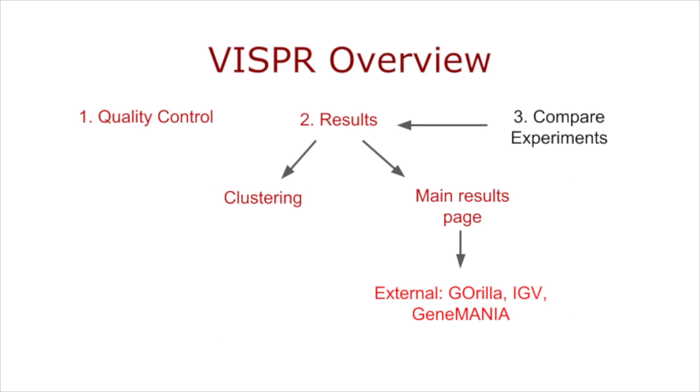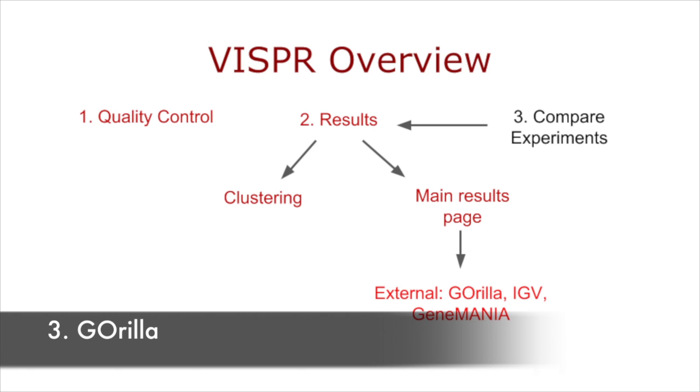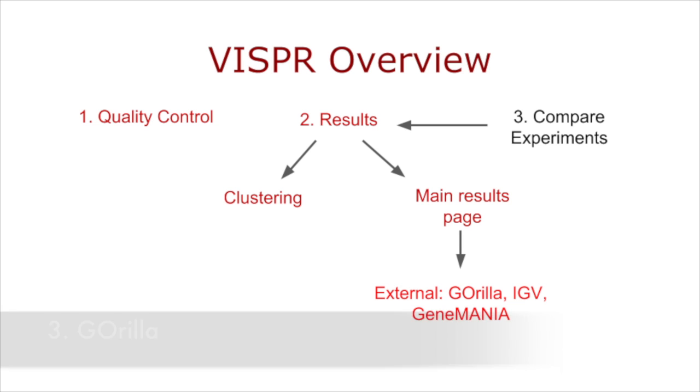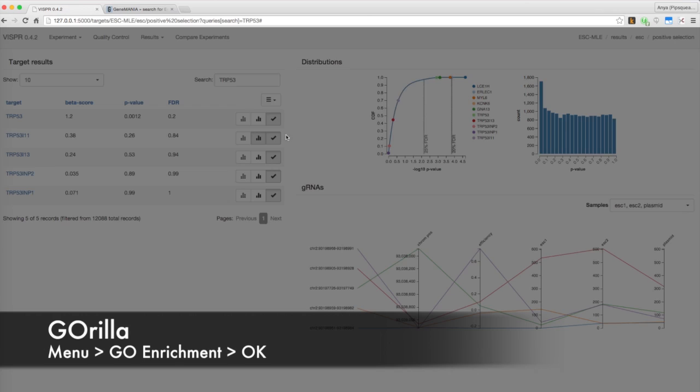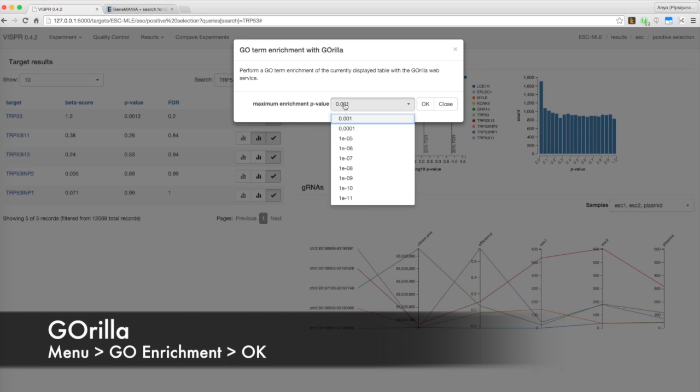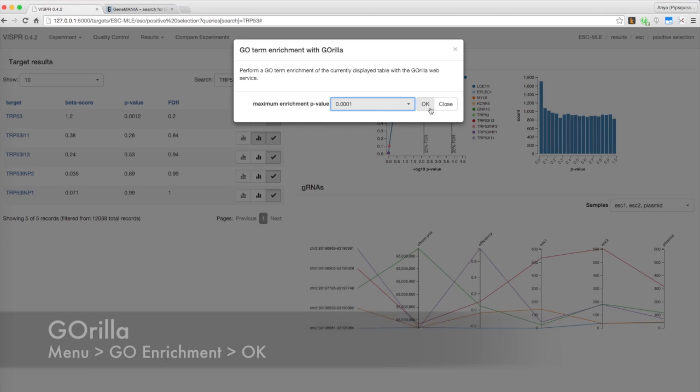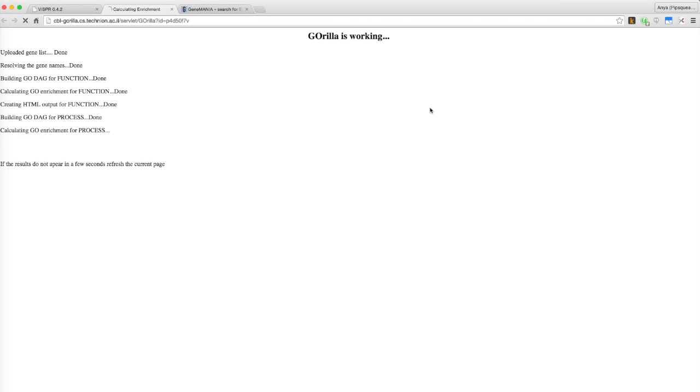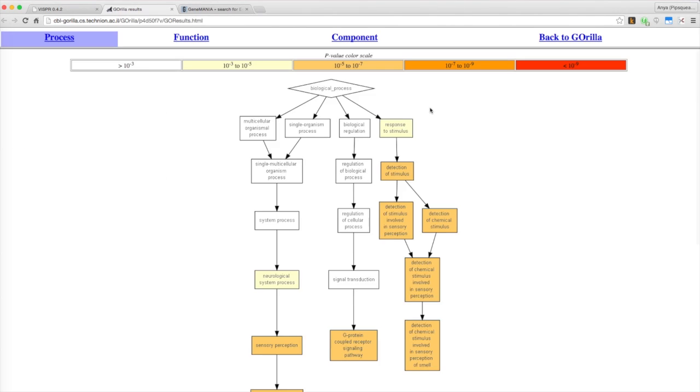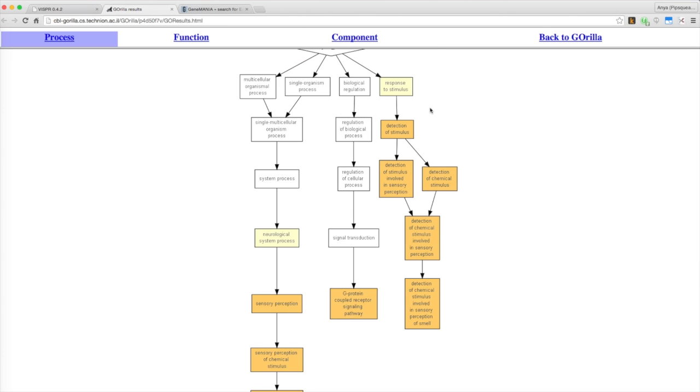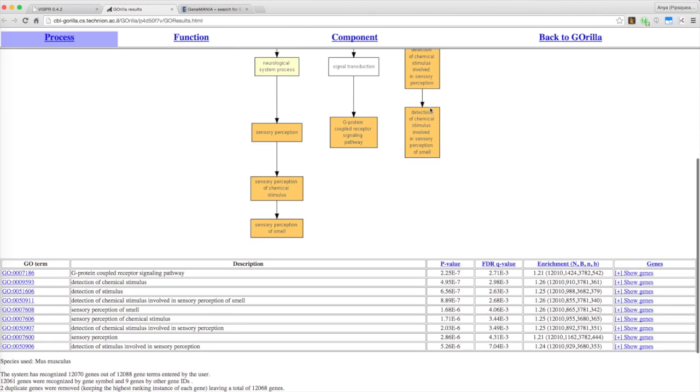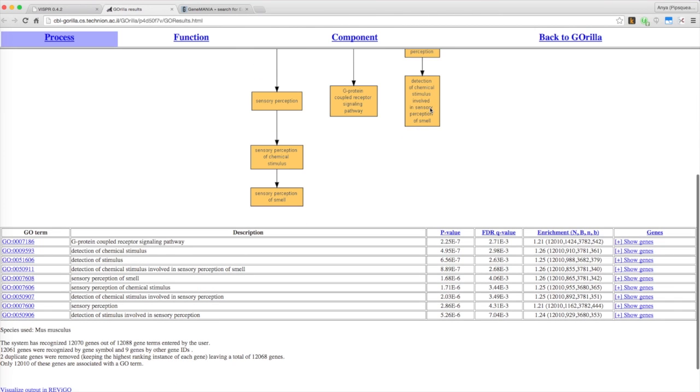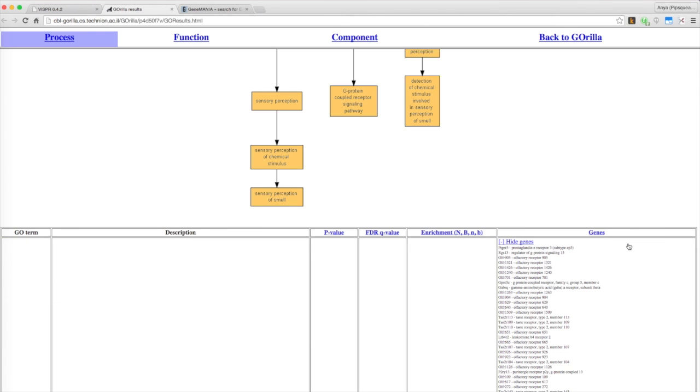As touched upon in the previous video, further functional analysis can be performed with GOrilla, an online Gene Ontology Enrichment Analysis tool. Select G-O Enrichment in the menu, pick a p-value upper limit, and hit OK. GOrilla will display a flowchart organizing enriched G-O terms with the colors showing their statistical significance. Below the flowchart, you will find a table listing all G-O terms and their statistics. Especially for negative selection experiments, this can serve as the fourth level of quality control.